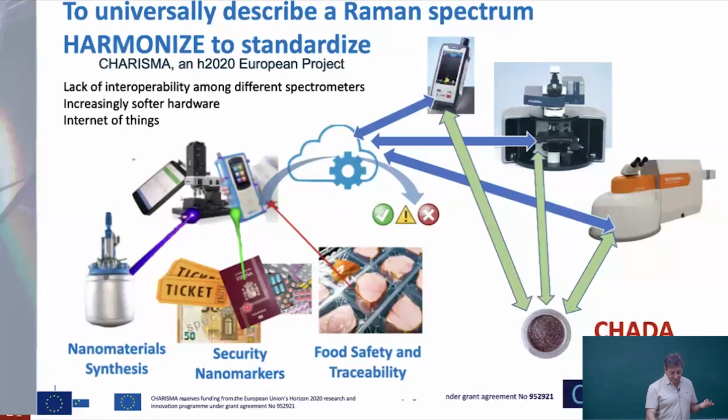In the case of the Spanish Mint, these Raman active markers that are added to the Euronotes and that are in the passport give a Raman signal that is also used for validation. You're not going to use that on an everyday basis, but the secondary high-level control will take advantage of these kinds of markers. Document security markers are an amazing universe. They have so many technologies, very high-level and advanced, against counterfeiting.